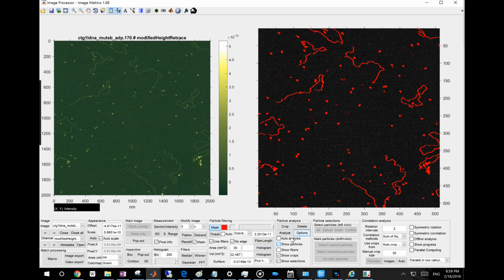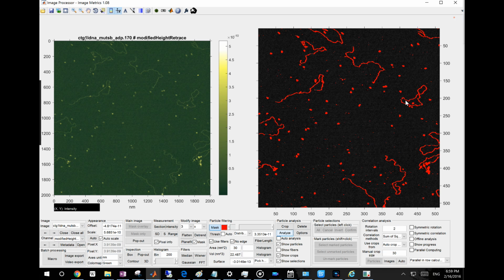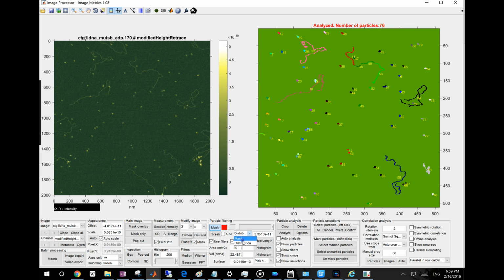So I would just click Analyze with all parameters chosen. Apparently, something is still going to the threshold procedures. You can click down, but it shouldn't really go to those procedures. What I would do is click Mask. In this case, if you just use Mask, it won't pop up a window. It should really directly give you the results.